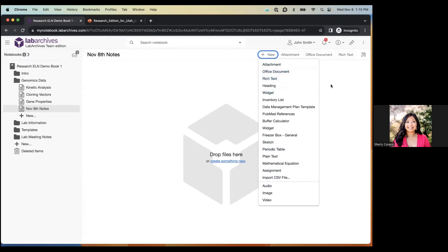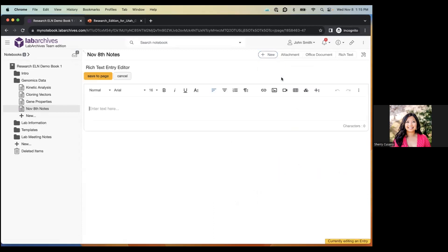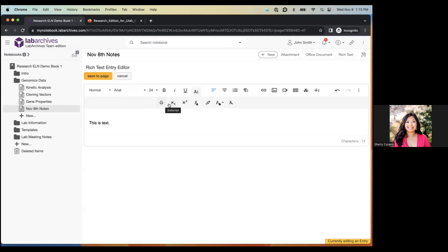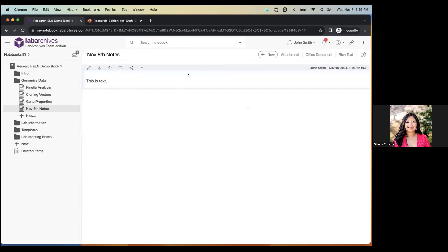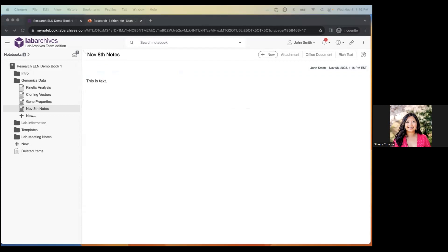One of the most popular entry types is the rich text entry. Go to Plus New, select 'Rich Text,' and you'll see a rich text window where you can type notes, observations, or create templates. Like any text editor, you can change the font, font size, use strikethrough, superscript and subscript, change color, set paragraph options, embed hyperlinks, and embed images and videos directly within the entry. Click 'Save to Page' when done.